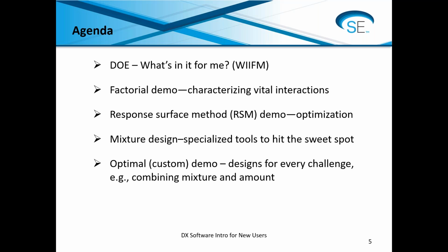We're going to look at a response surface design where the goal of the experiment will be to really find the optimal conditions. Then we're going to look at the specialized tools that we have for a mixture design where we can find the sweet spot of a formulation. We have optimal custom designs for every challenge where you could just basically let the software build a custom DOE for you, and we'll take a brief look at what that's about as well.